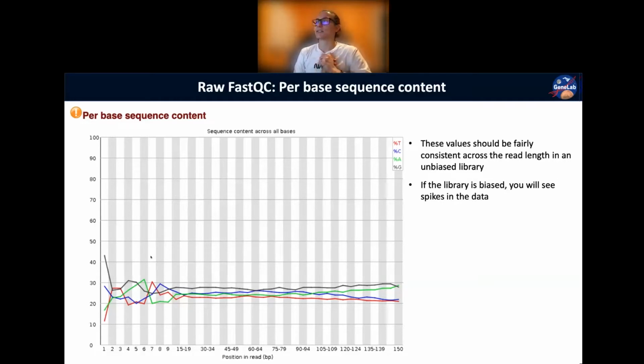Yeah, Ty's got it. Remember, for RNA-seq data, we start with RNA, right? Our first step in library preparation is to remove ribosomal RNA or enrich for poly A, and then to chop it up. After we chop it up, our next step is to convert that RNA into cDNA. When we do reverse transcription, converting it to cDNA, we use a kit that uses random hexamers in the priming of the RNA. Presumably, we hope that those random hexamers are unbiased.